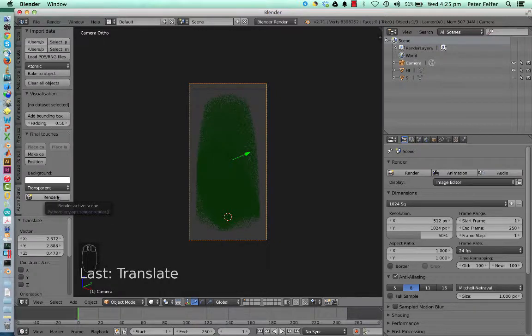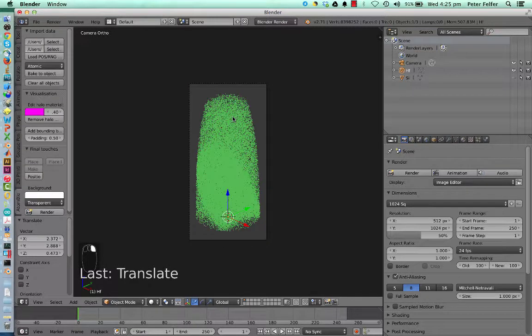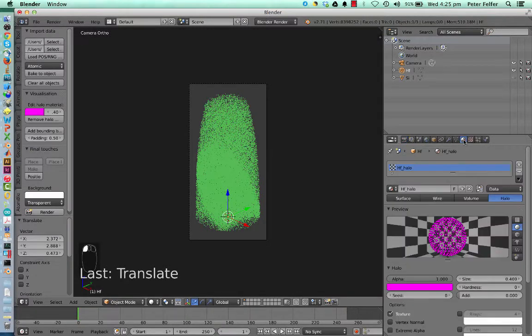One of the parts of this tutorial is actually showing you what the background of this visualization technique is. And what we've done right now is for each vertex we've produced, we've just put a picture there. And this picture is called a halo material. What a material is, it tells the renderer how to visualize a certain object.